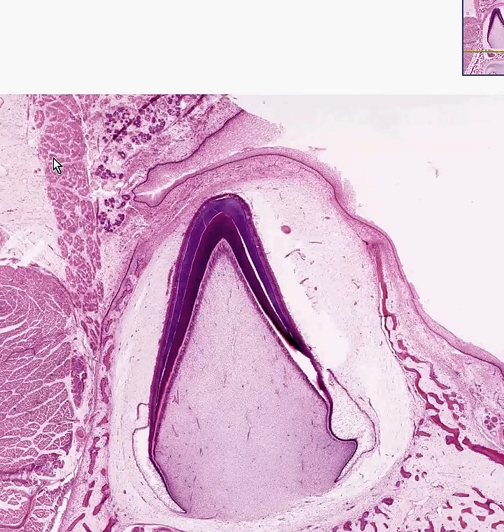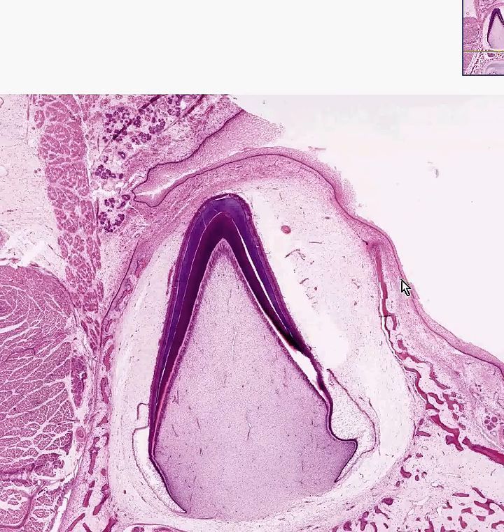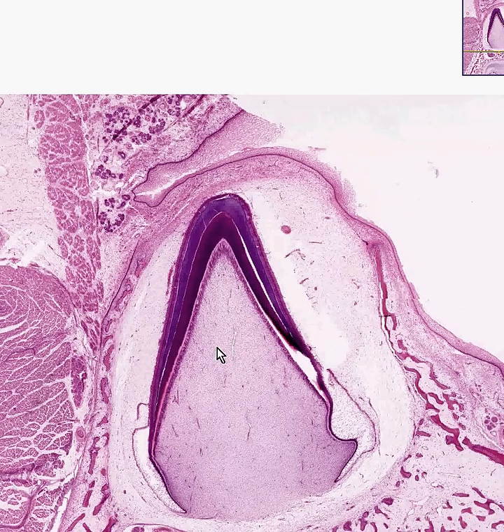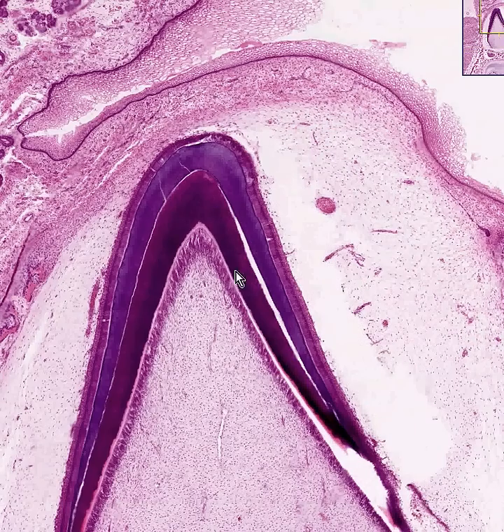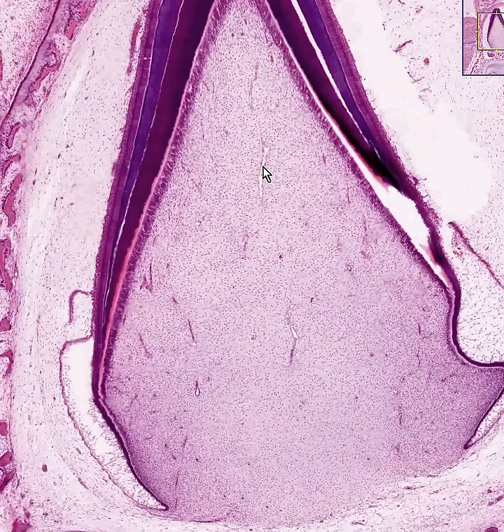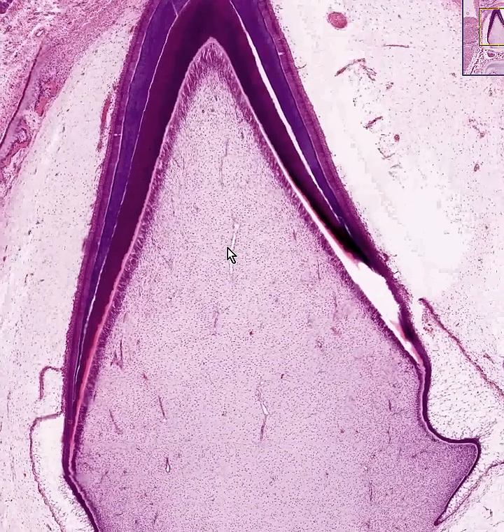This is an erupting tooth and it is beautiful because it demonstrates everything. First of all, once again, you can see the overlying squamous mucosa. Secondly, you can see a good degree of development in the alveolar bone. Thirdly, you can see a nice loose vascular pulp cavity of the tooth, in which you can see basically a loose primitive-looking connective tissue and a lot of blood vessels, which you see along here.